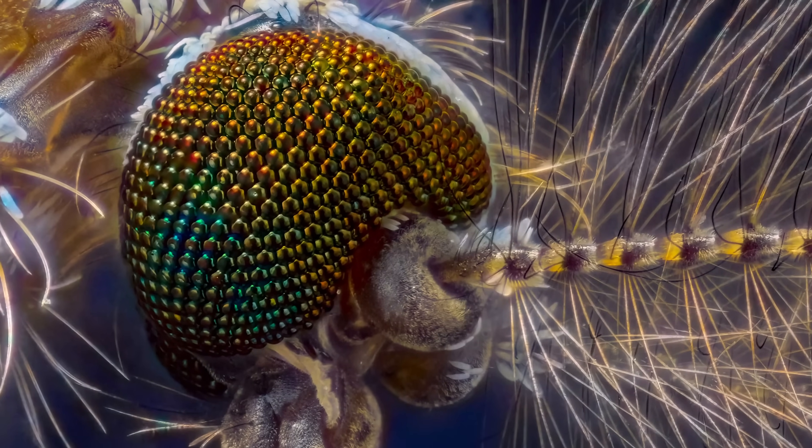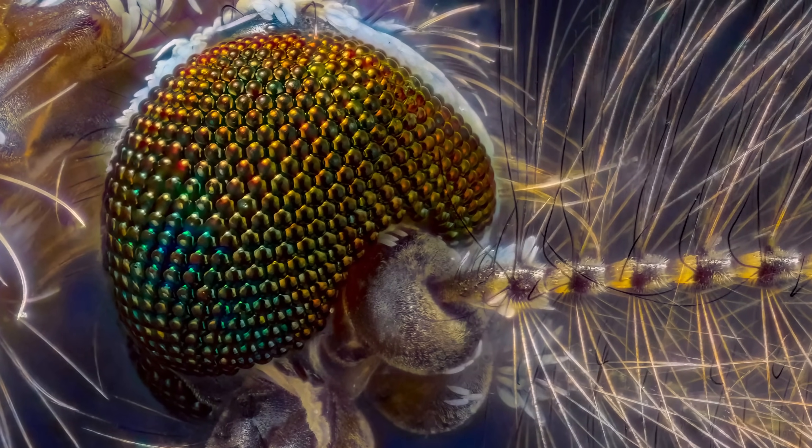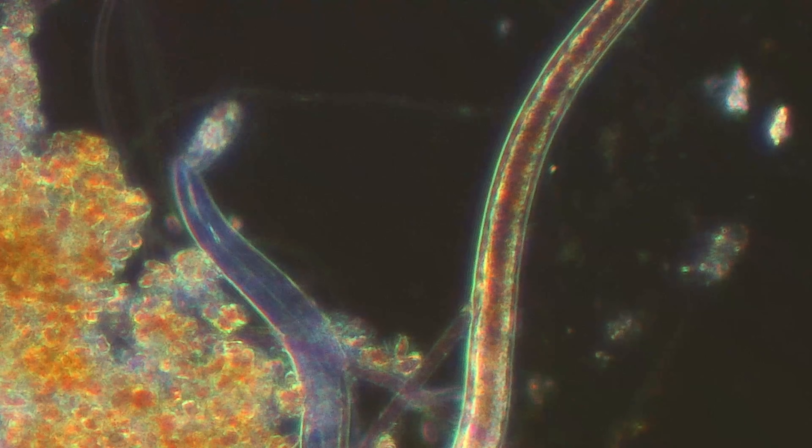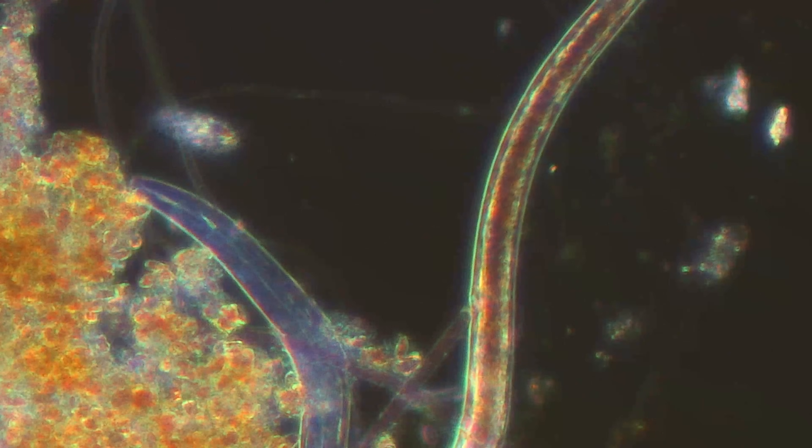Microphotography is one step further. It's photographing the small within the very small. It's going from photographing structures that measure barely a few hundredths of a millimeter, which is what we achieve in extreme macro photography, to elements or structures that in their entirety measure only a few microns.